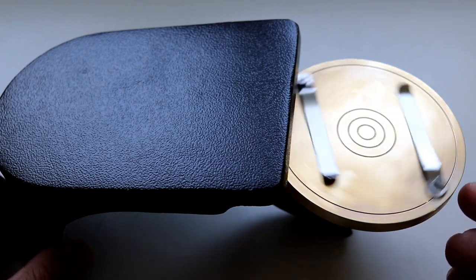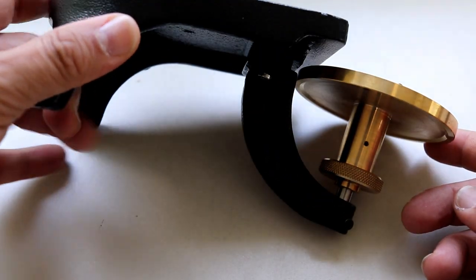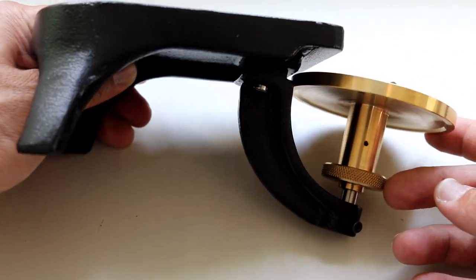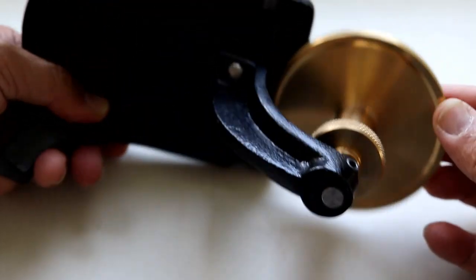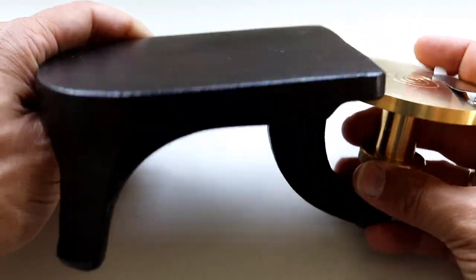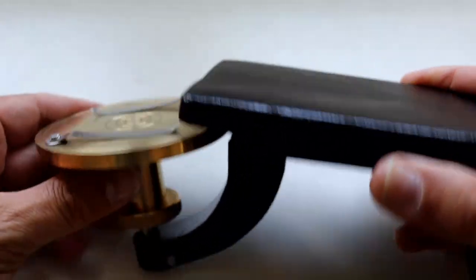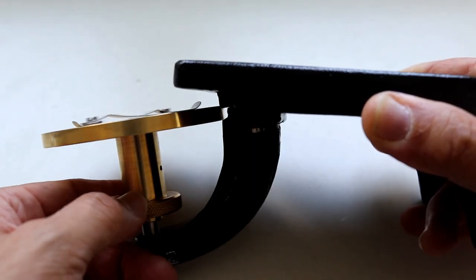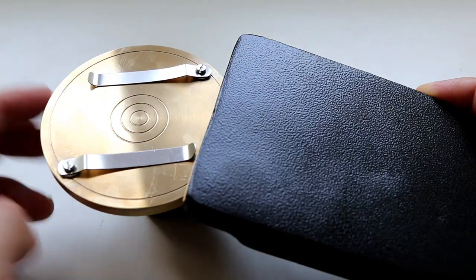Now let's have a closer look. First of all, the thing that kind of surprised me is that the ringing table was actually turning quite smoothly, so there seems to be some kind of ball bearing in there. It was quite smoothly, well made, the whole thing very solid. You can also see that on the brass or copper table there are some rings engraved, and these are basically guidance so that the slide is properly centered.